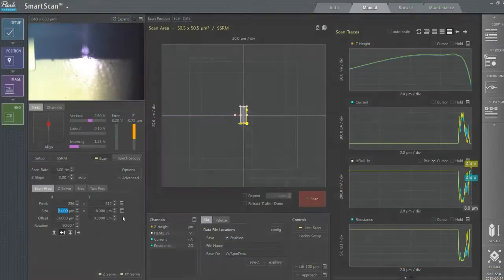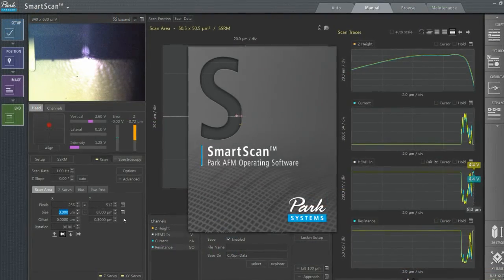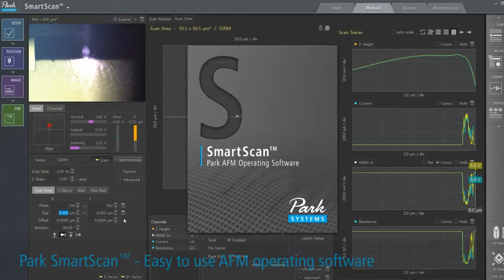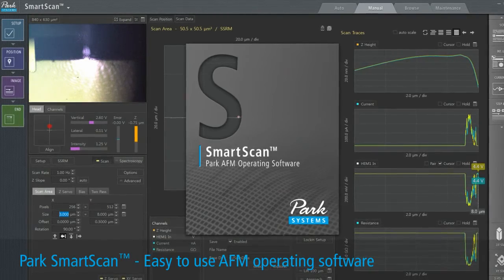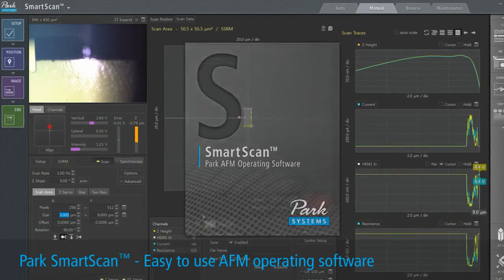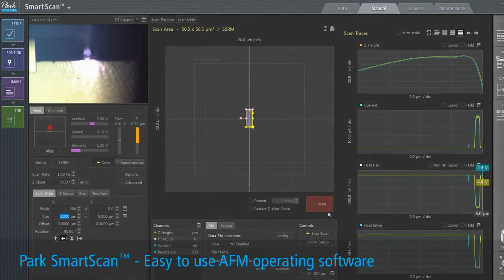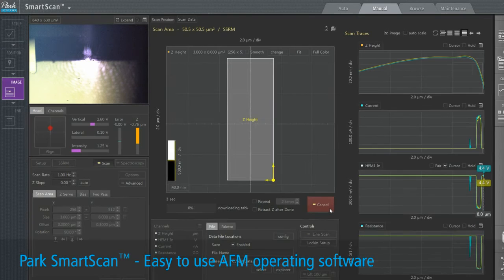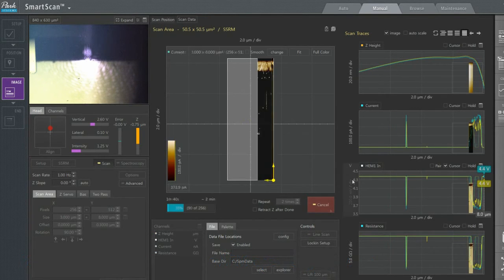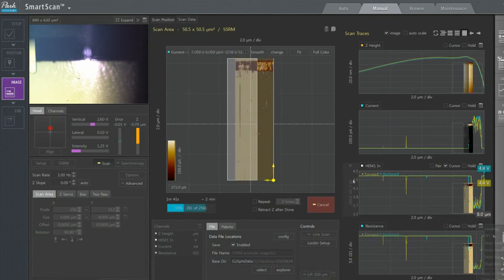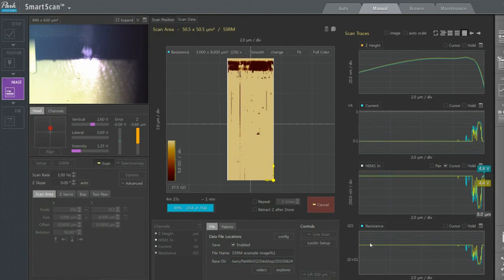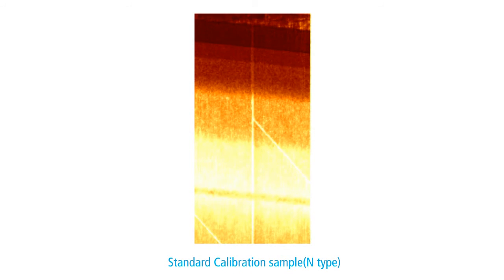Lastly, PARC-NX HIVAC comes with the world's easiest to use AFM operating software, PARC SmartScan. Its auto mode gives users the ability to repeatedly acquire high-quality images with a simple three-click sequence. This gives PARC SmartScan a powerful interface element that supports our commitment to user-friendliness.